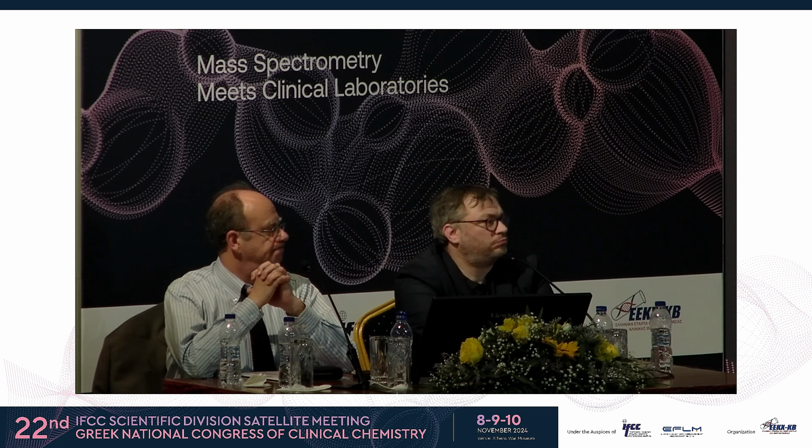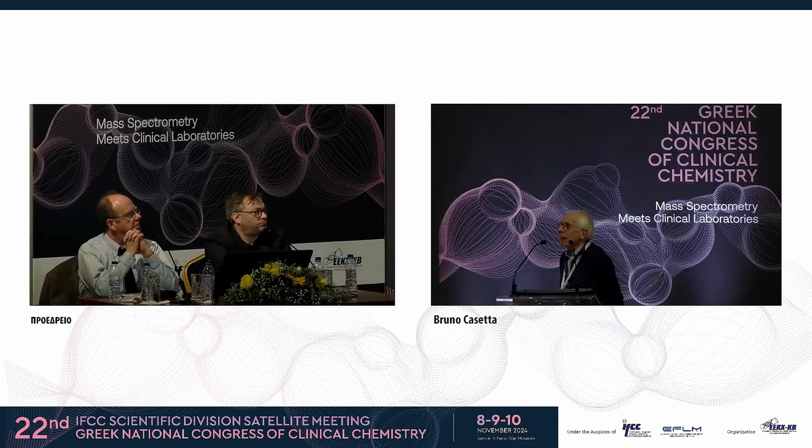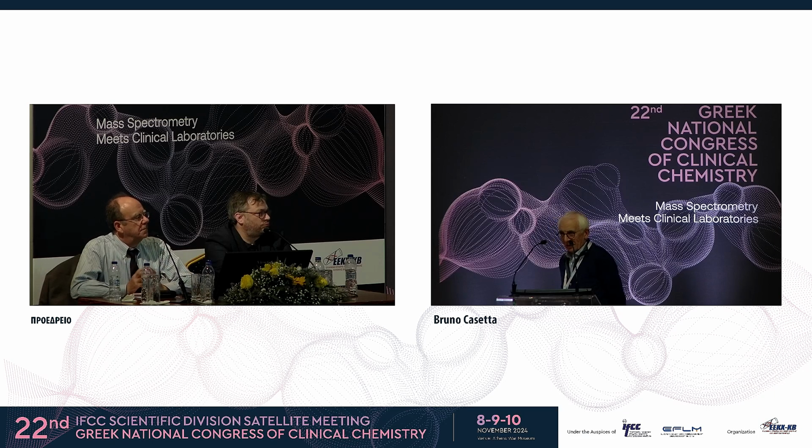Okay, if I understand well what you are complaining about, I know the iTRAQ very well. In fact, I was inspired by the iTRAQ. Of course, the reagent is different. And keep in mind that even with the iTRAQ at that time, we didn't emphasize so much the fact that, like any derivatization reagent, they are very sensitive to humidity, okay?